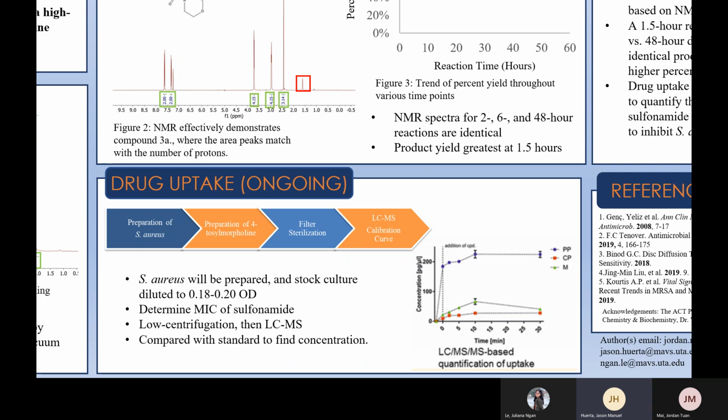So from what we have tried, we learned that our synthesized drug does not dissolve in broth. So we would like to test out DMSO 5%, as it has been shown in studies that this does not kill the bacteria. Another issue we encountered is that since we incubated the bacteria for too long, we were not able to dilute the bacteria to the desired OD. So this quantitative study is still ongoing, so we will continue to repeat the process.